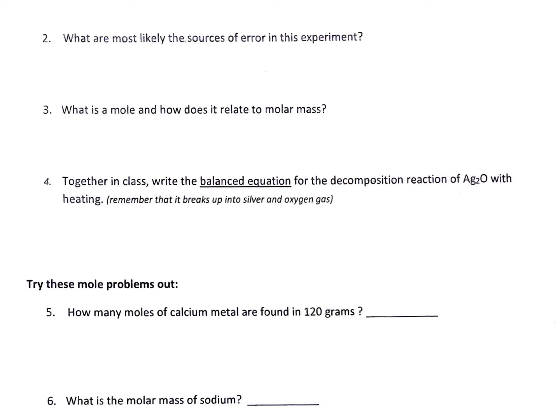So when you're measuring, are there any issues with that? When you're reacting the compound, is there any potential issues with that? What tiny little issues could have been involved with our lab that ends up getting our numbers off slightly so it's not identical to what's on the periodic table? Go ahead and pause this video, answer that question, and then we'll move on to number 3.